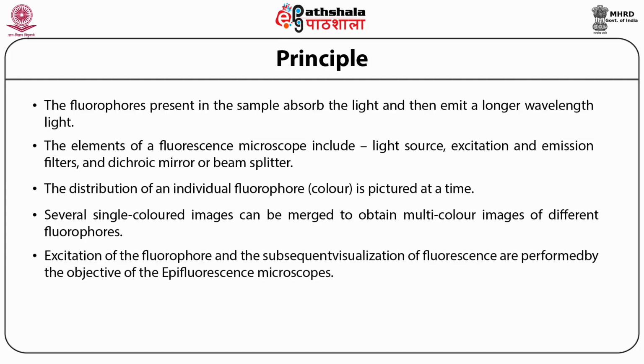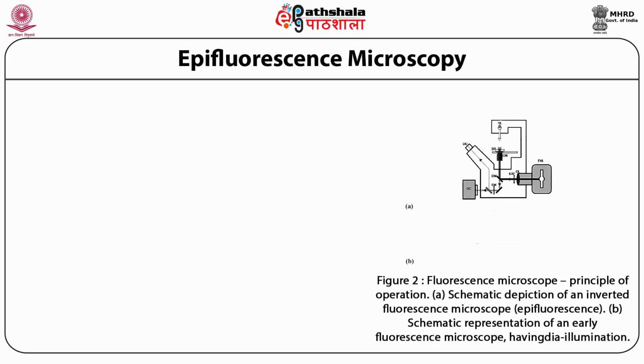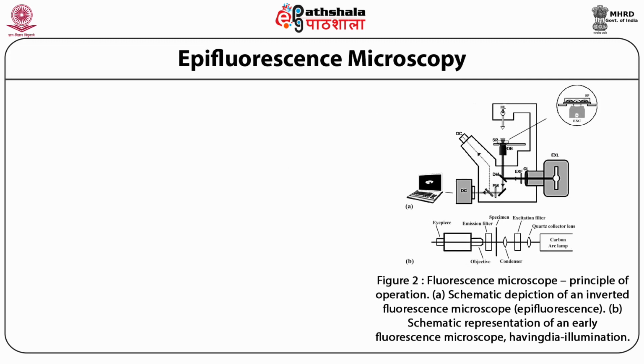Excitation of the fluorophore and the subsequent visualization of fluorescence are performed by the objective in epifluorescence microscopes. Advanced microscope designs include the confocal microscope and the total internal reflection fluorescence microscope, abbreviated as TIRF. Let us now discuss epifluorescence microscopy in detail.